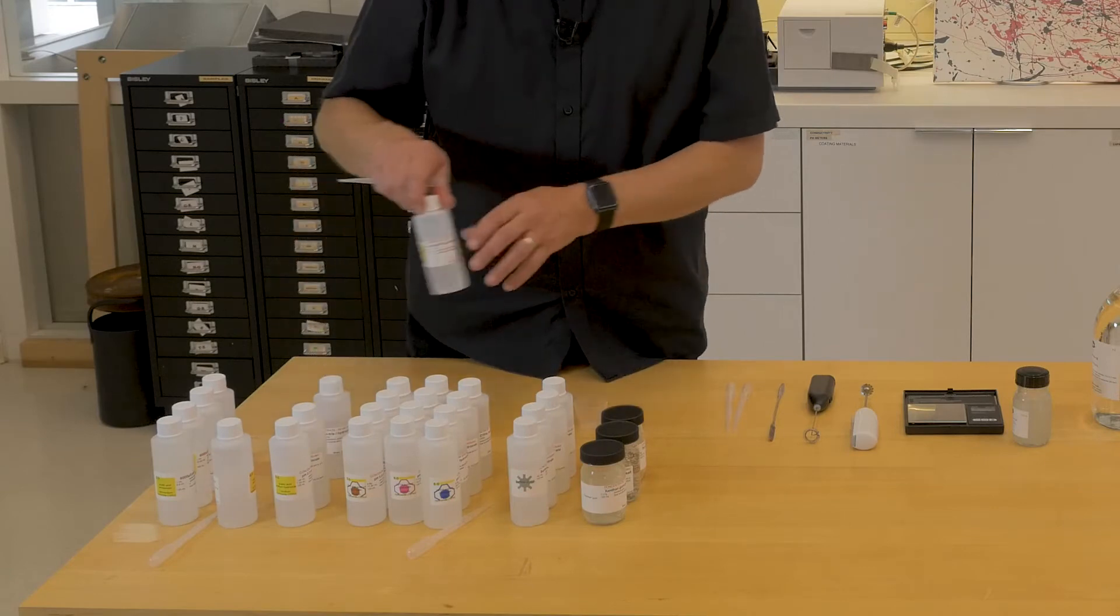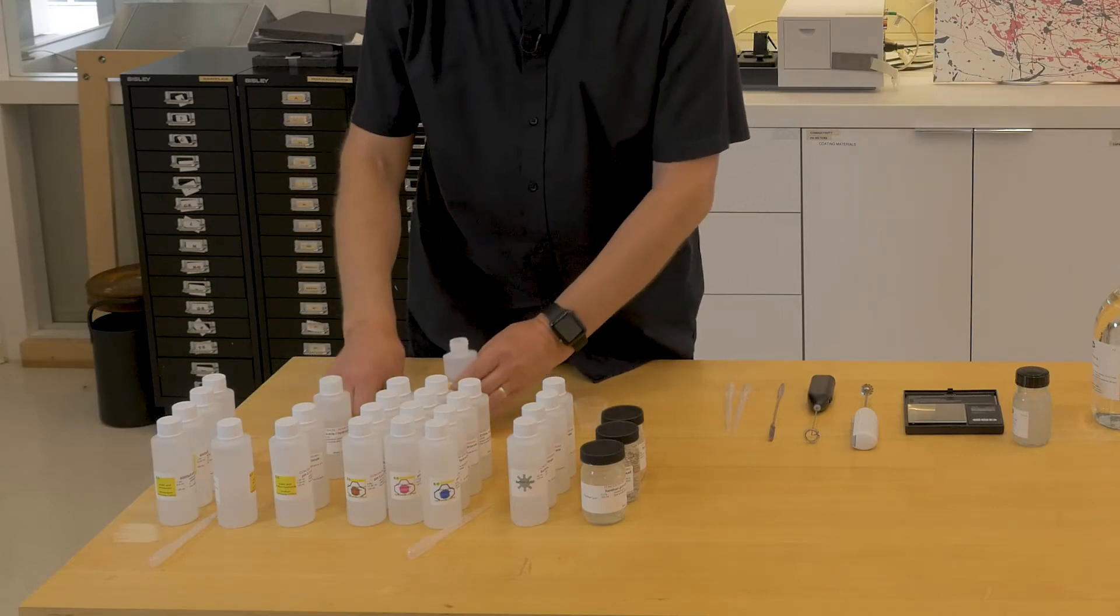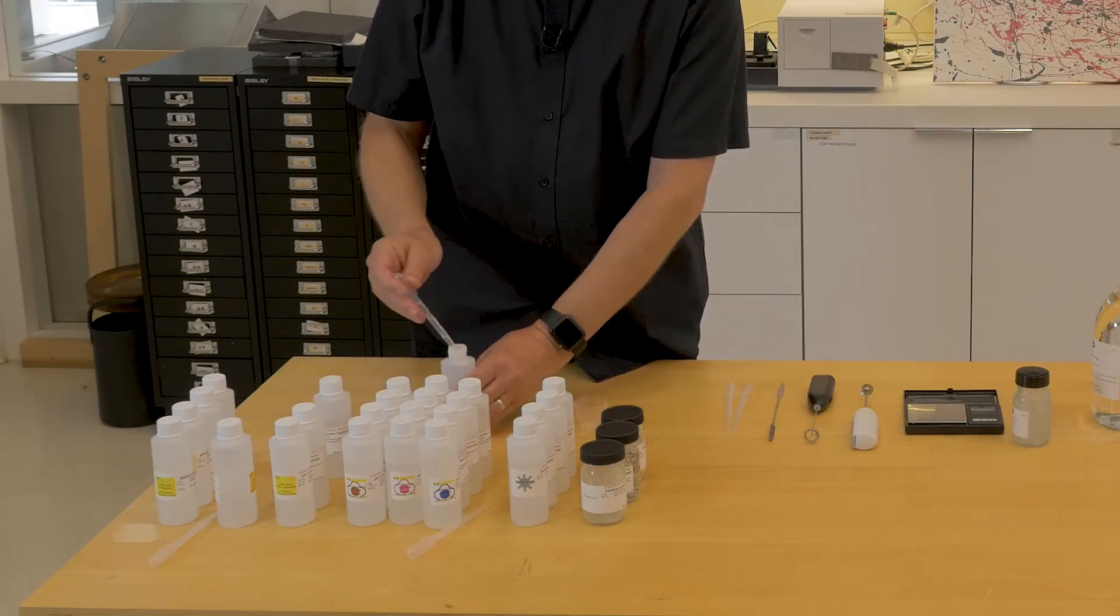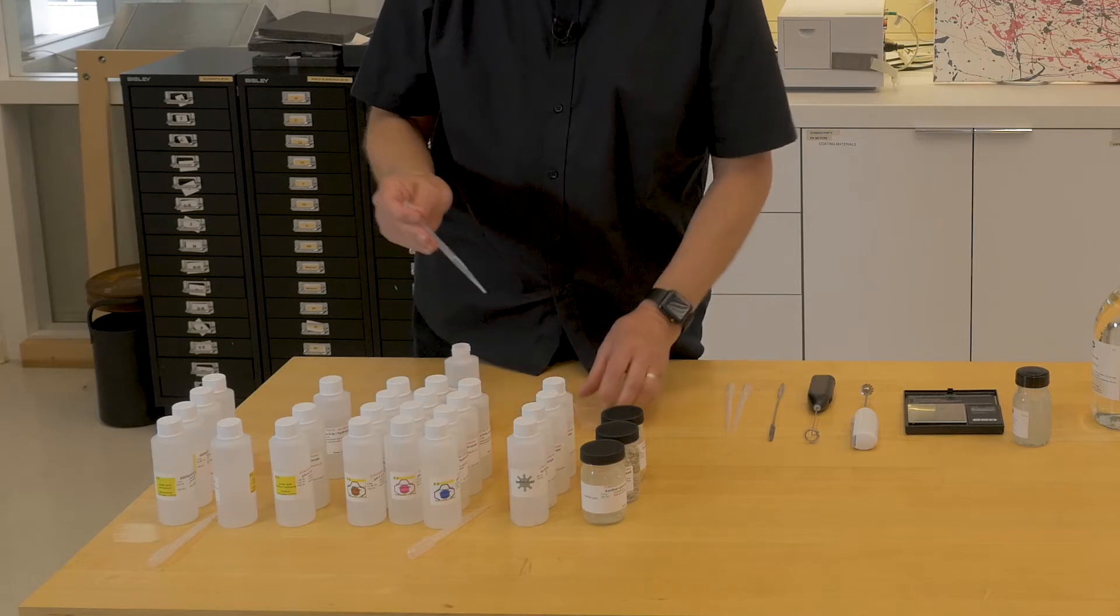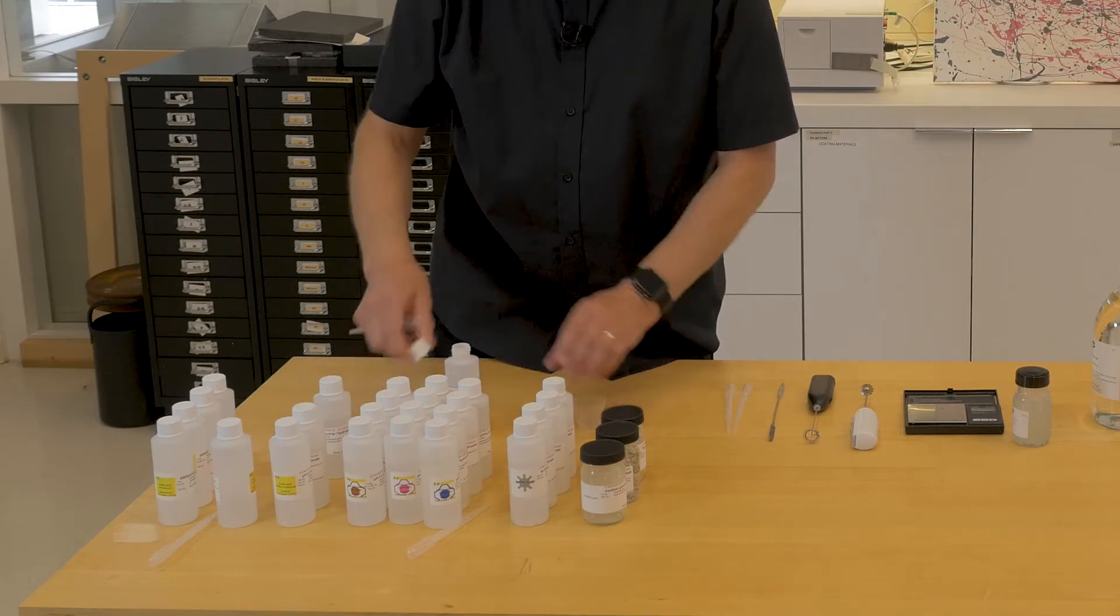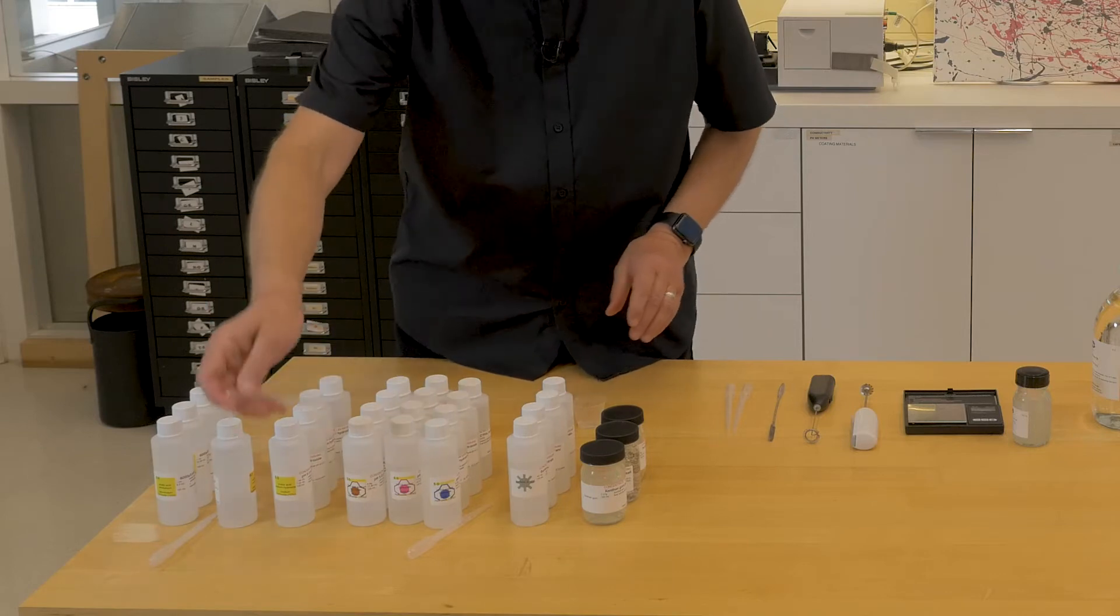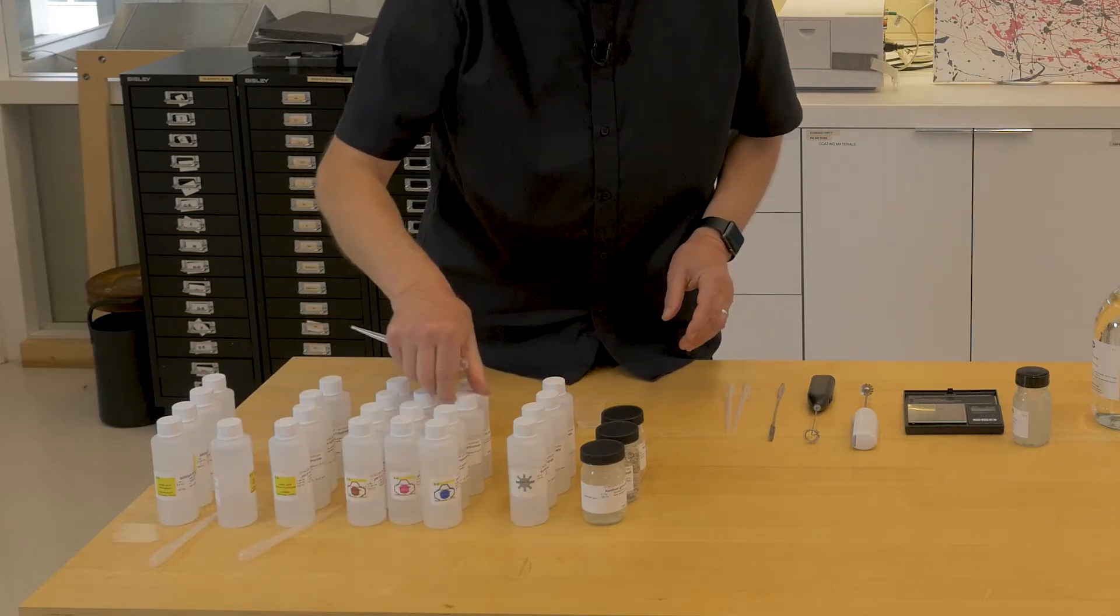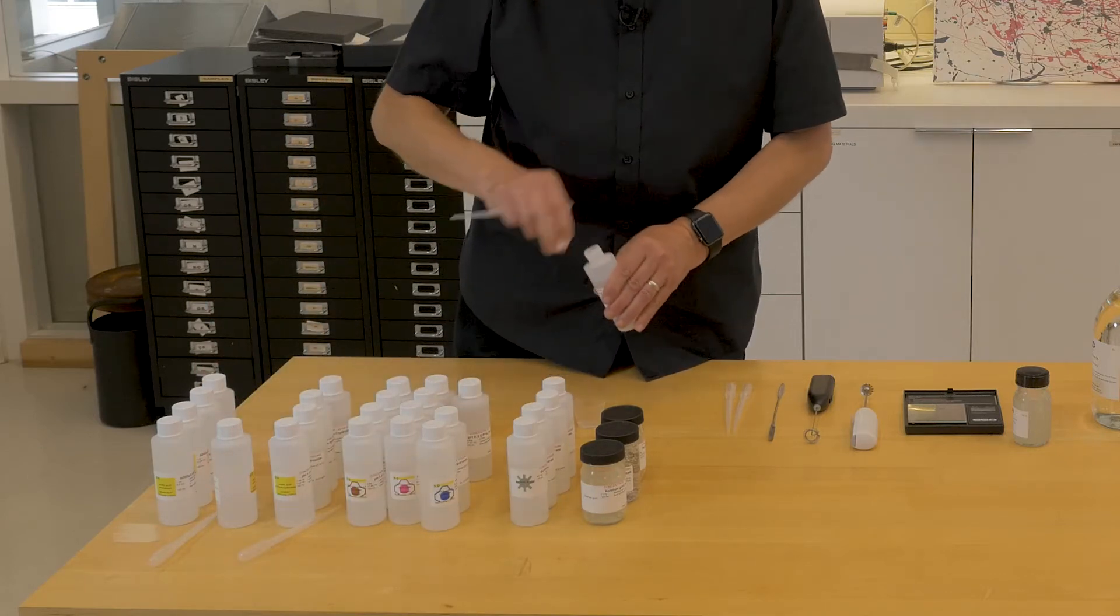So, we take 1 ml of pH 6.0 buffer, MES, 1 ml of DTPA at pH 6.0, our chelating agent.